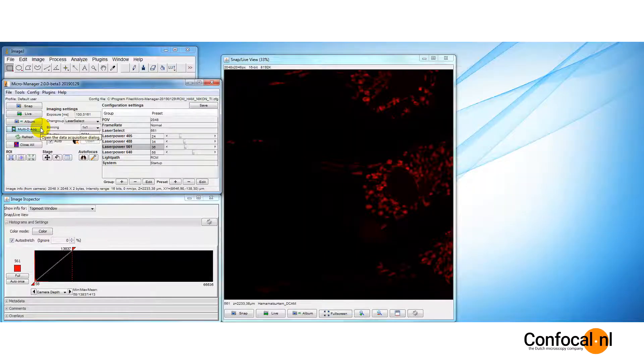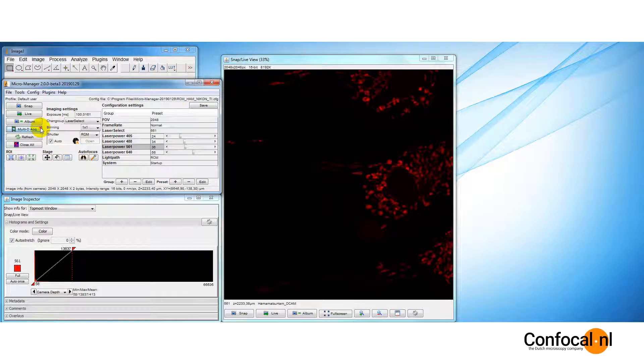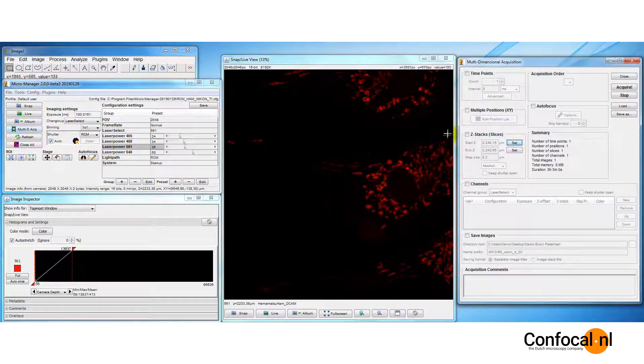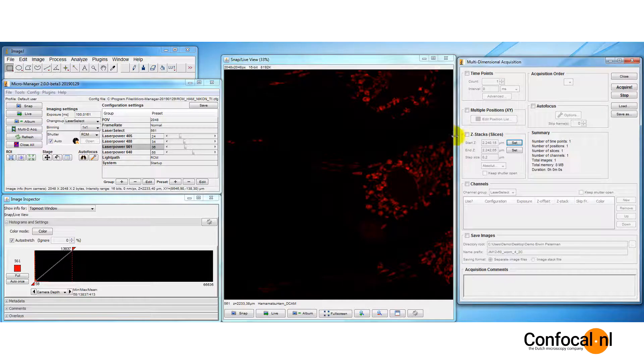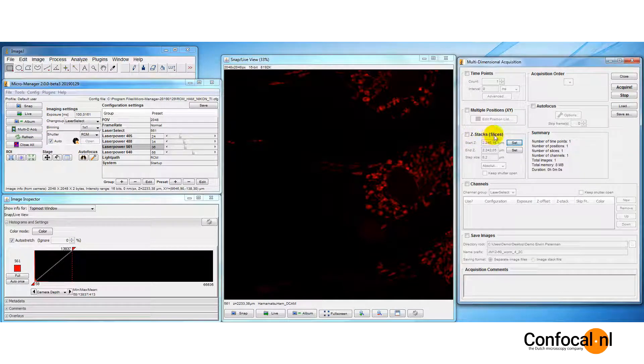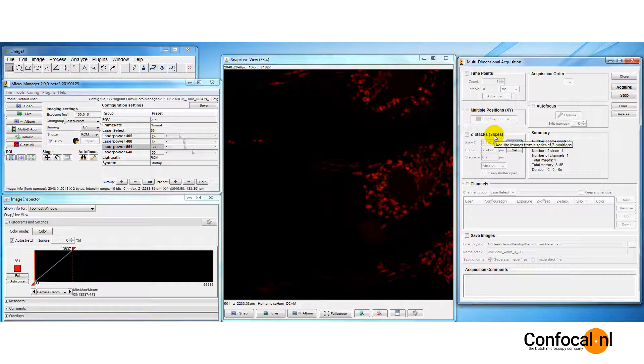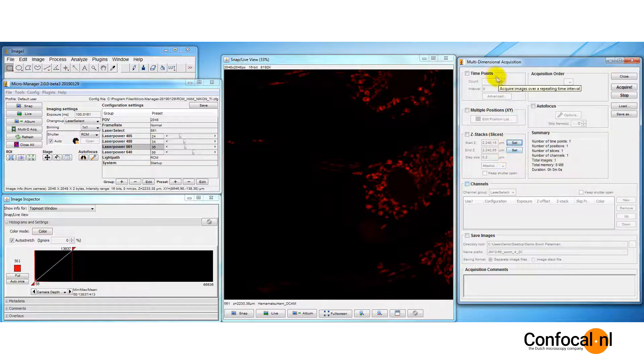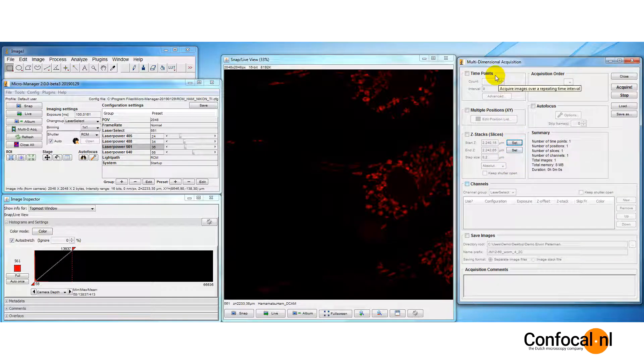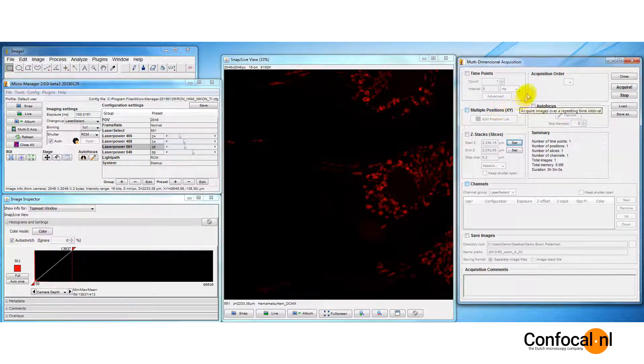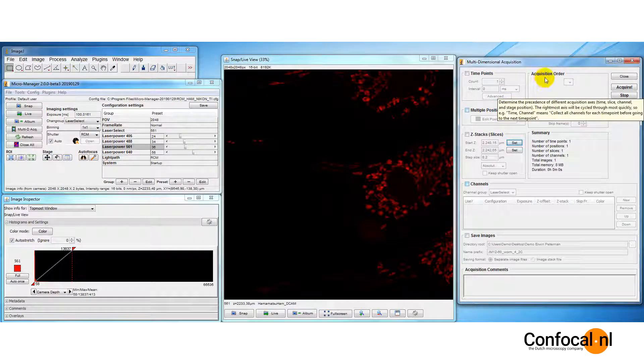To acquire a multi-image stack, press the multi-dimensional acquisition button to open the acquisition control. Let's perform a z-stack. Micro-Manager allows you to create a stack as multi-channel wavelength coordinates, multi-frame time coordinates, multi-slice z-coordinates, multi-position xy-coordinates, or any combination of these.